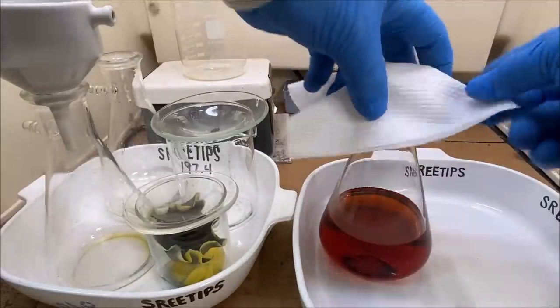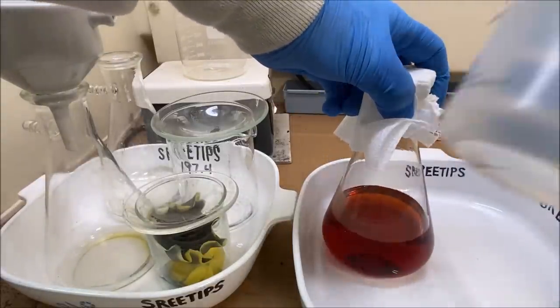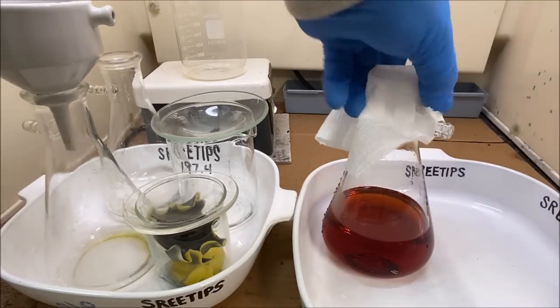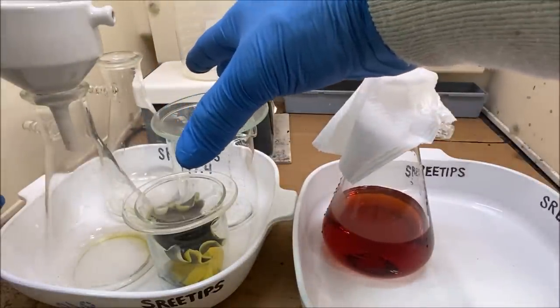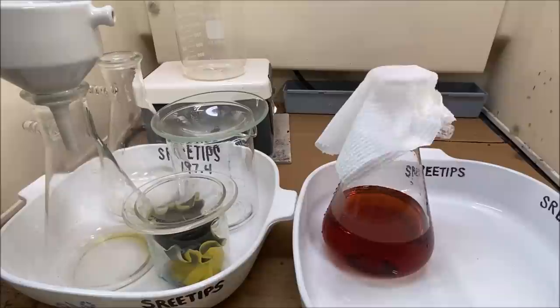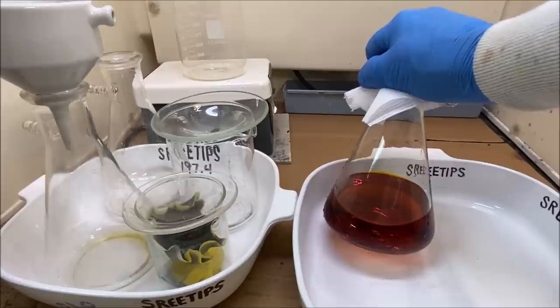Before I go, what I'd like to do is point out what we're going to do with the residue that's in these glass containers up here. I'll rinse all this into my stock pot where the dangerous platinum metals are in solution. We'll cement that on the copper and we'll get that all cleaned up and make it safe. And then we'll process this liquid here in part four.